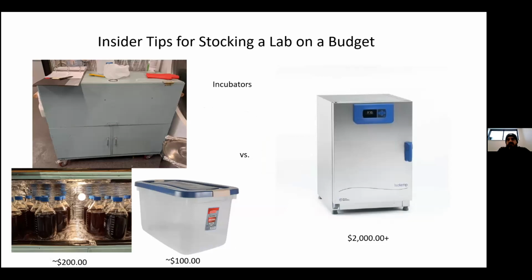Incubators. So again, extremely expensive if you get them from a science supplier. We've got some pretty handy people around here. So one of our guys built this incubator, which is built from plywood effectively and lined with reflective tape inside, and then we have basically a terrarium type light bulb to provide heat, and that's connected to an external thermostat.